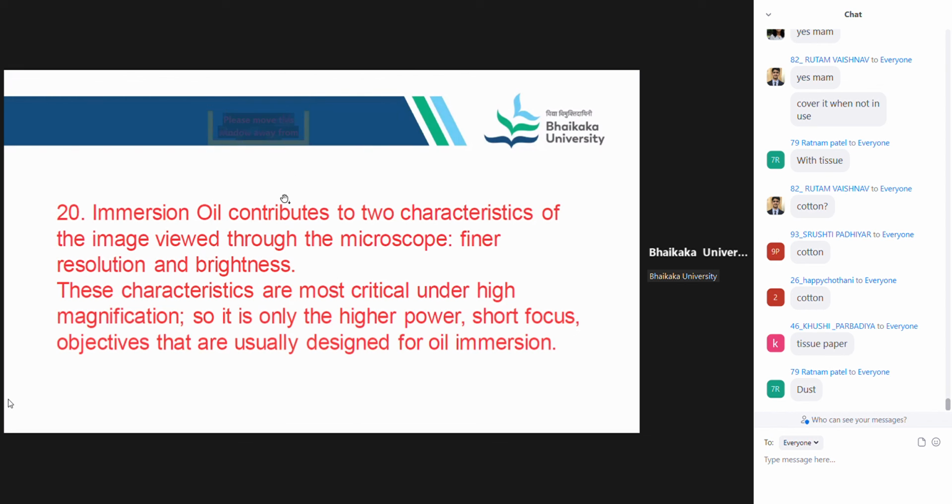Okay, so this is enough for the day. Plus, every few months you need to clean the microscope, also with tissue paper, and the cover that you use to cover the microscope should also be washed regularly.